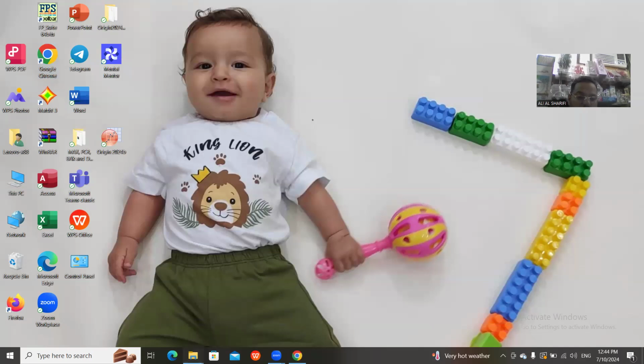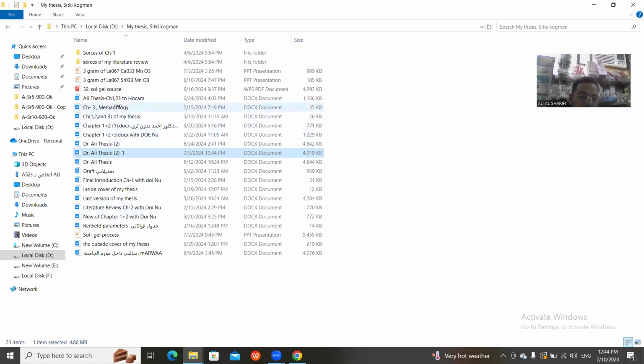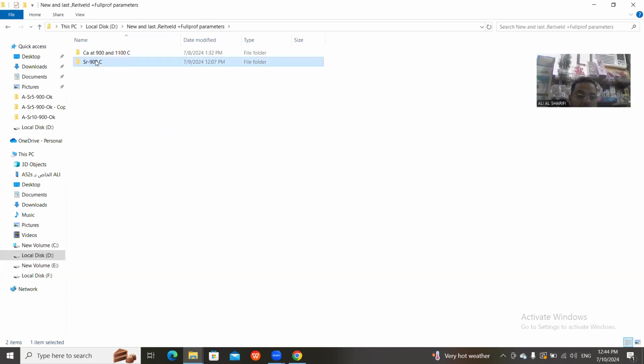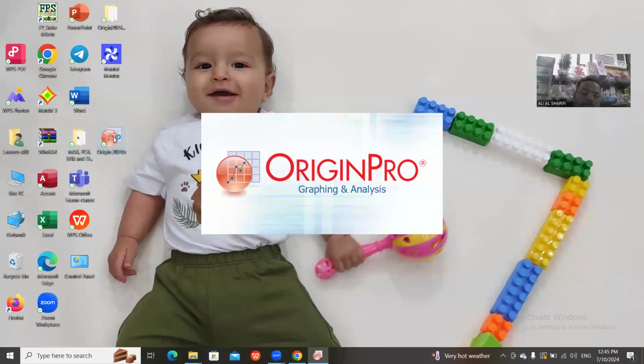Now let me go to upload it. Now let's search for the XYN file. This one was created from FullProf a few moments ago. I will work on this file by using Origin. Let me go to Origin. Bismillah.